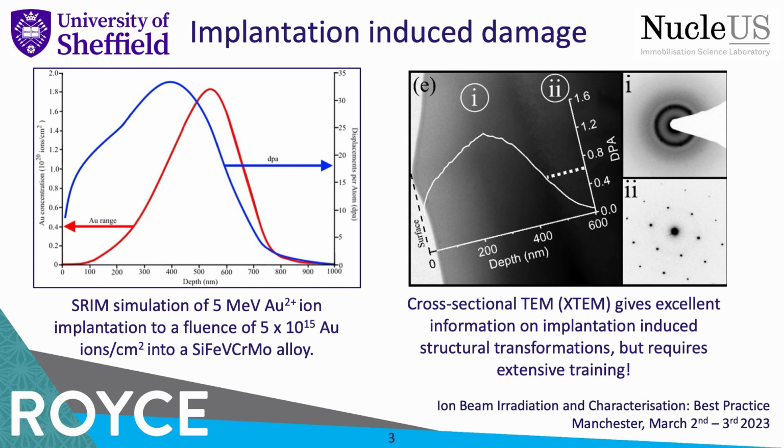in our materials. What if there was another technique that we could use that allowed us to rapidly scan loads of different materials in a matter of a few hours to have a look at whether there are any implantation-induced structural modifications to our material?